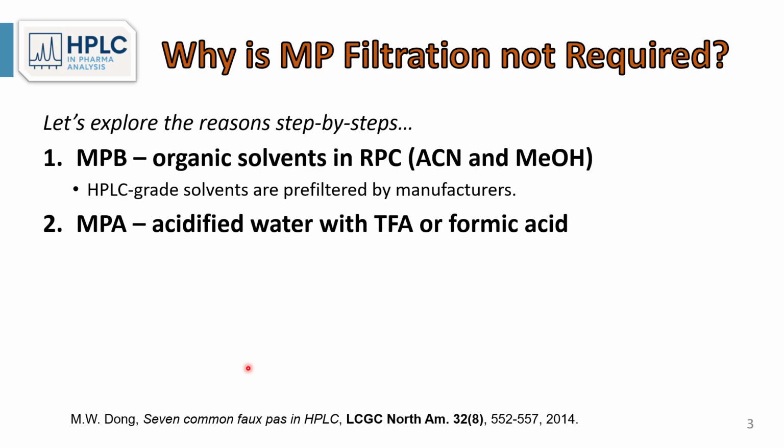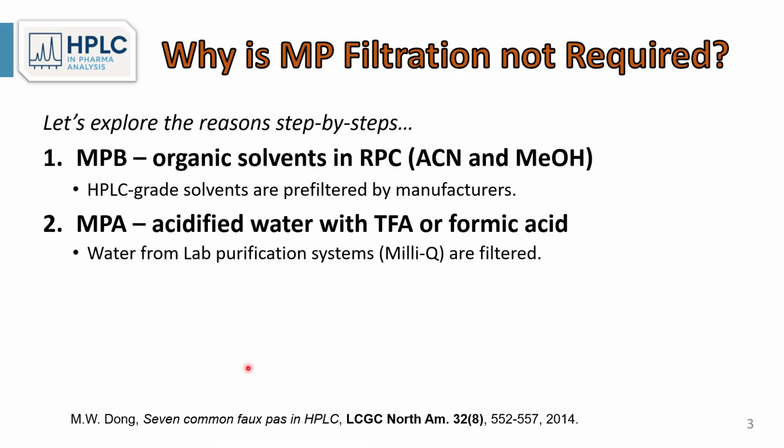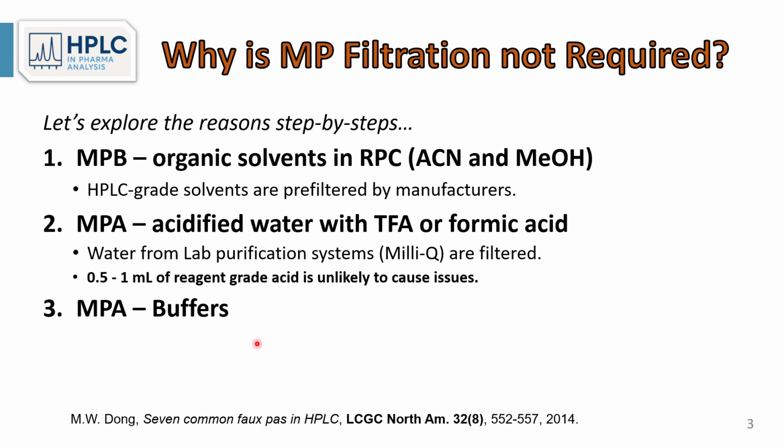Second, mobile phase A is acidified water with TFA or formic acid or acetic acid. Because water from lab purification systems such as Milli-Q is pre-filtered, and also the very small amount of reagent grade acid is unlikely to cause issues.